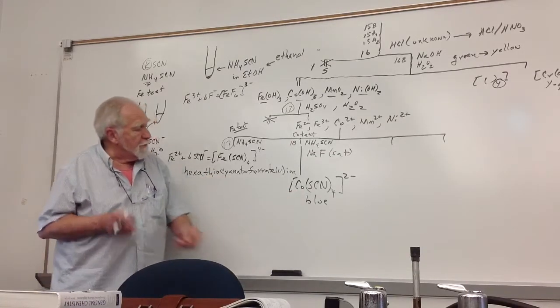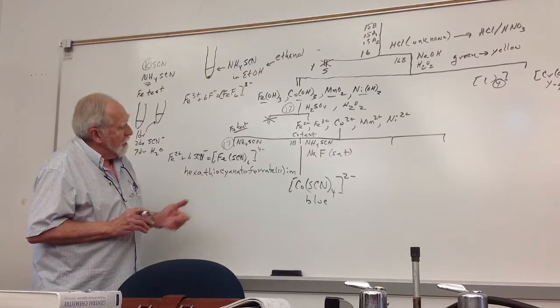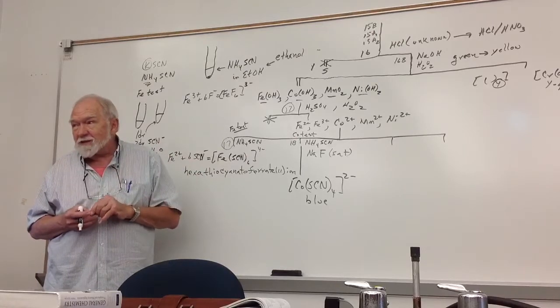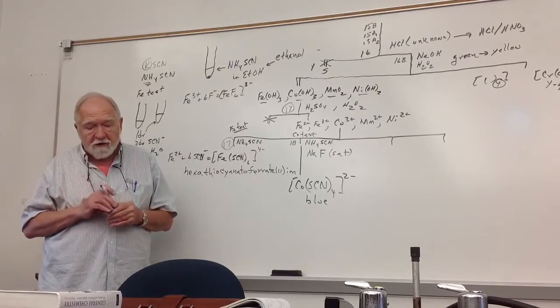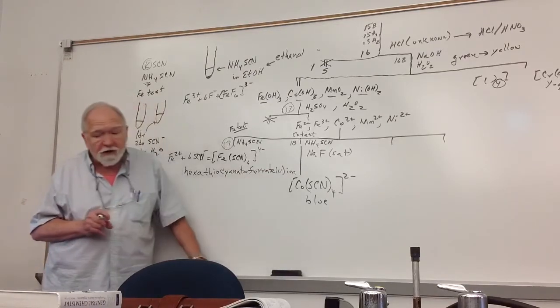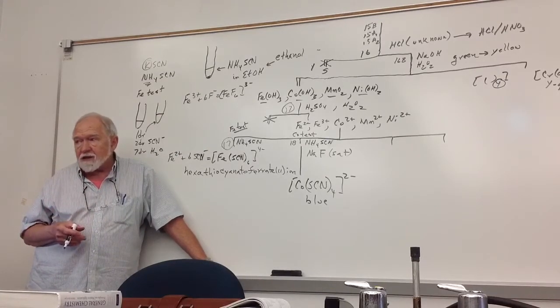The problem is I don't put alcohol out there for you to dilute it with, and chances are the medium blue, if you diluted it, would already be almost an invisible blue. But there is enough of a color gradation that you can tell whether you're getting really dark, and I'll comment about your blue color when you bring it up, just to see how close you are to what it should look like.